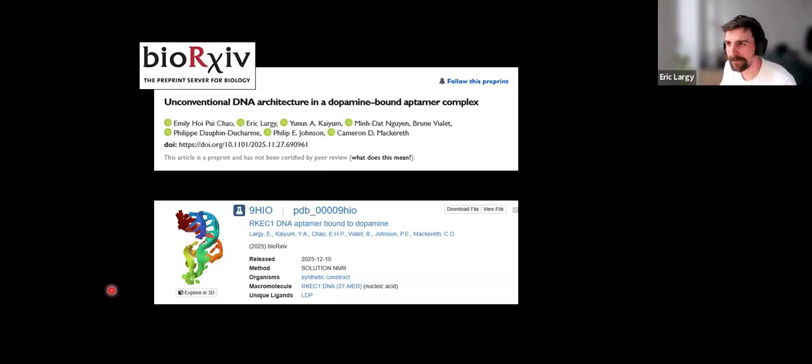Yeah, okay. So no, I didn't try TIP3P for this one. 4-point models are a bit more accurate in terms of water physical properties, and we have access to a very nice GPU cluster. So the cost of running a bit more complicated models is not an issue, really. Given that in these particular applications we have many NMR restraints, there's not much the DNA can do actually. It's really well described at the experimental level. So I don't think the water model would impact the results significantly.